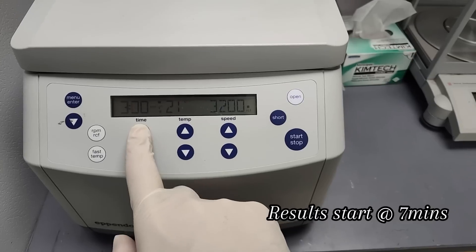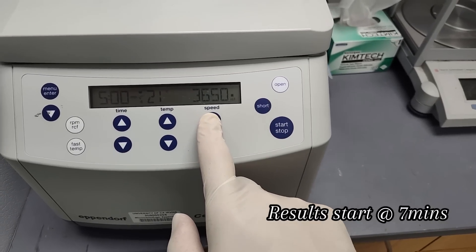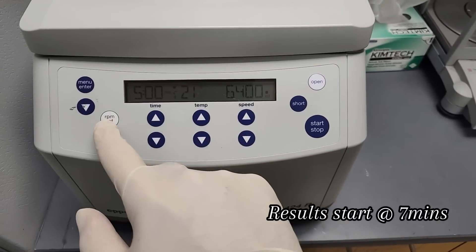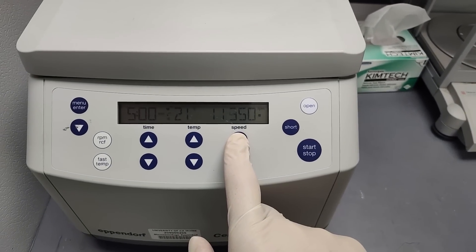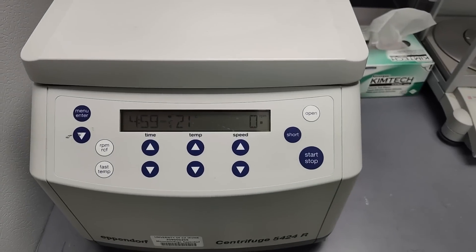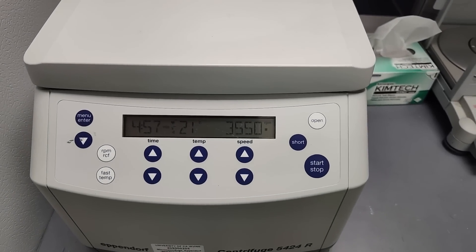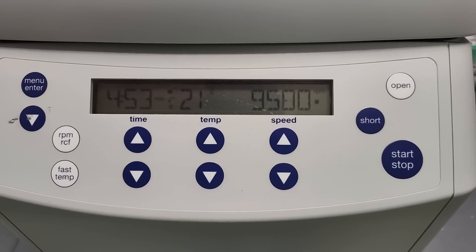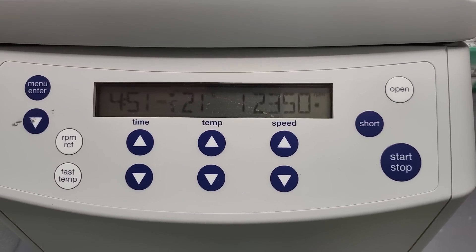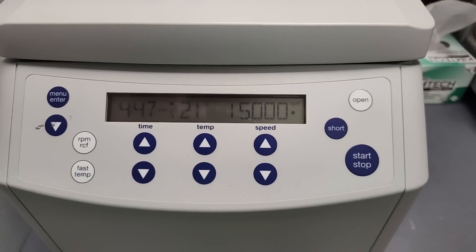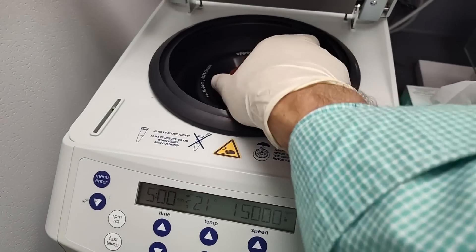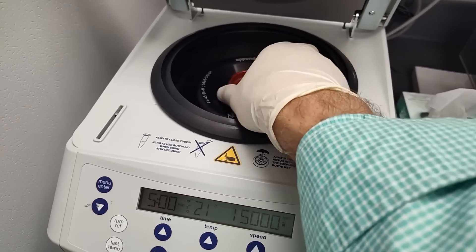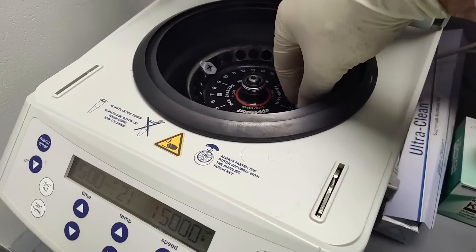It says to go for five minutes at 15,000 RPM. There we go. It's a centrifuge. I bet these two look real different just by the color going in.